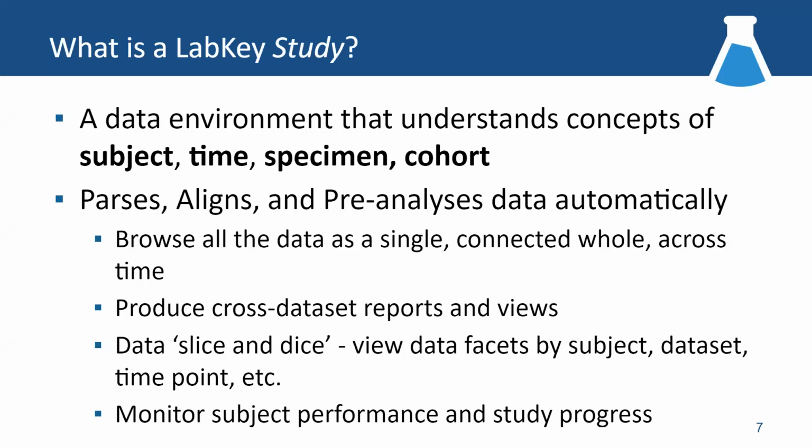This pre-analysis, and pre-integration, allows you to really browse all the data as a single connected whole. It allows you to build queries and tables and visualizations that cross all the different data sets that you may have brought into your study. What I mean by that is it's going to allow you to take a part of your specimen data and a part of your laboratory data and a part of your clinical data and view it all together as a single table and do those cross data set analyses.